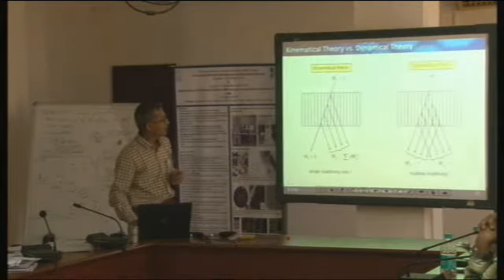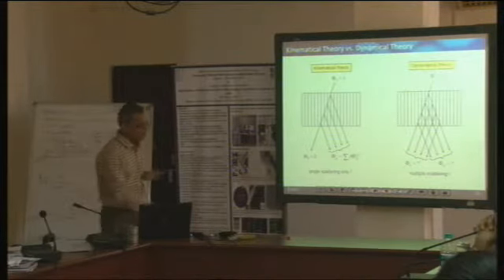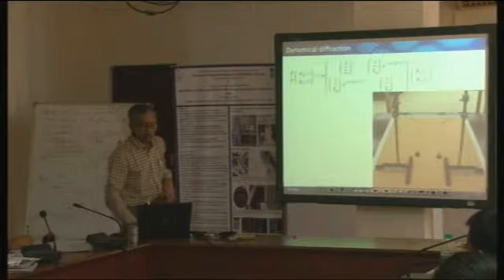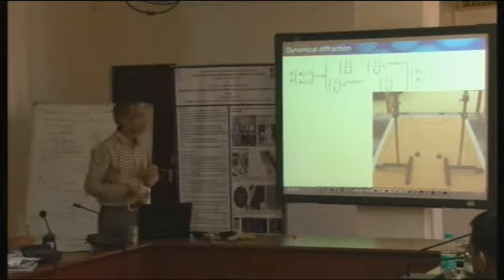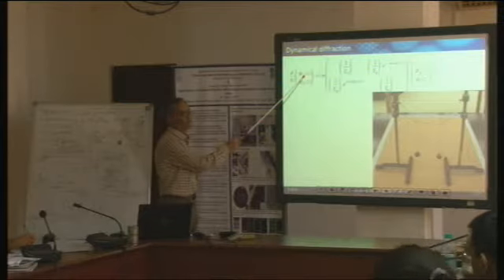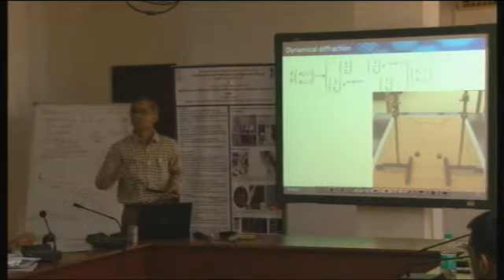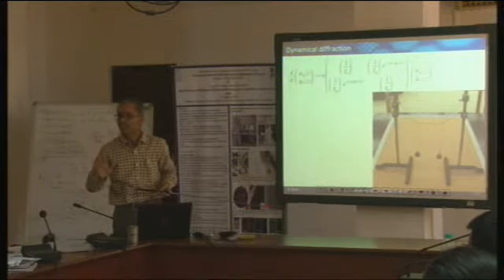That's why this image was shown, and it's a good point to try to consider dynamical effects. So people have tried to consider, okay, we try not to neglect the diffracted beam. How do they consider it? Now the mathematics becomes slightly more complicated, so I have tried to show it here. See, this is the diffracted beam intensity, this is the zeroth beam intensity, and now we don't say anymore that the zeroth beam intensity is going to remain constant at one. We take away that assumption.